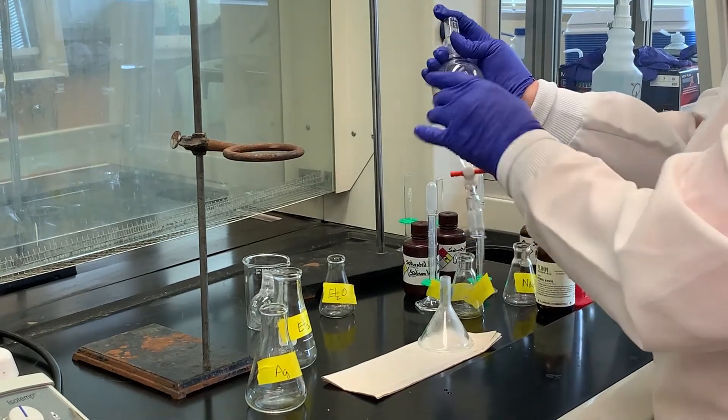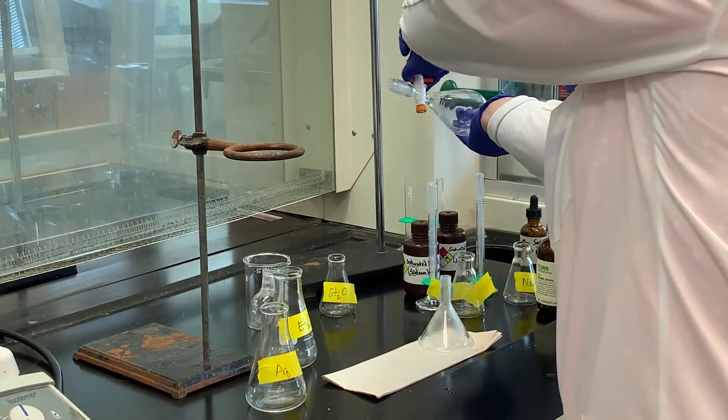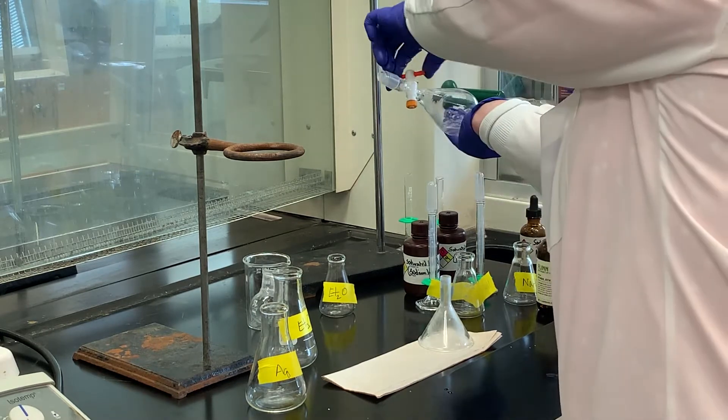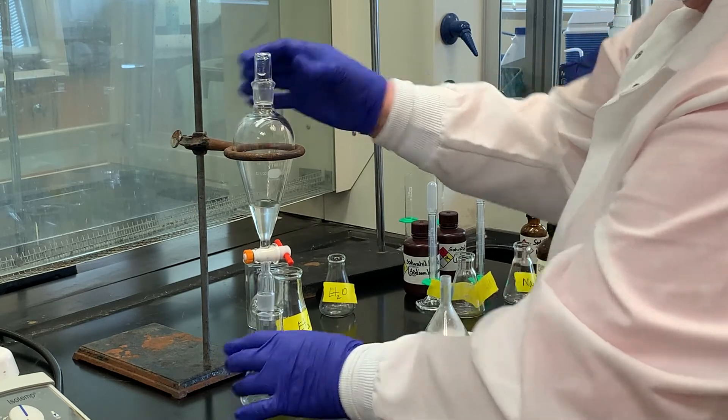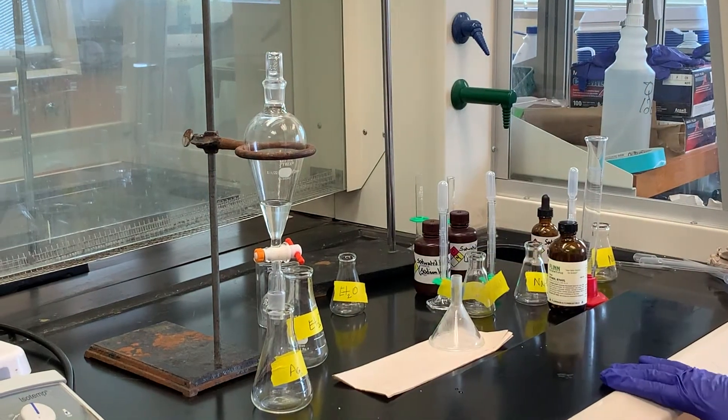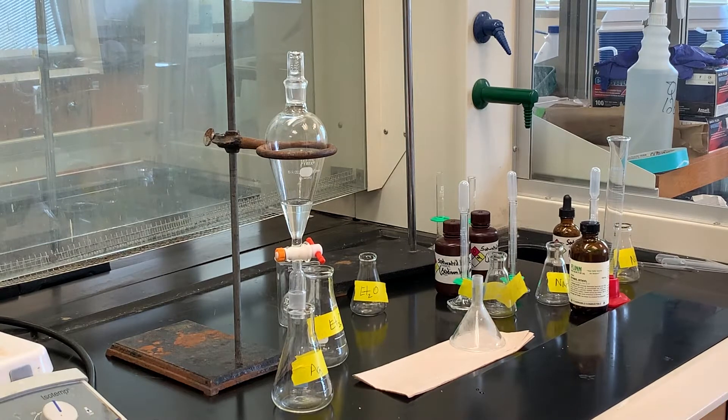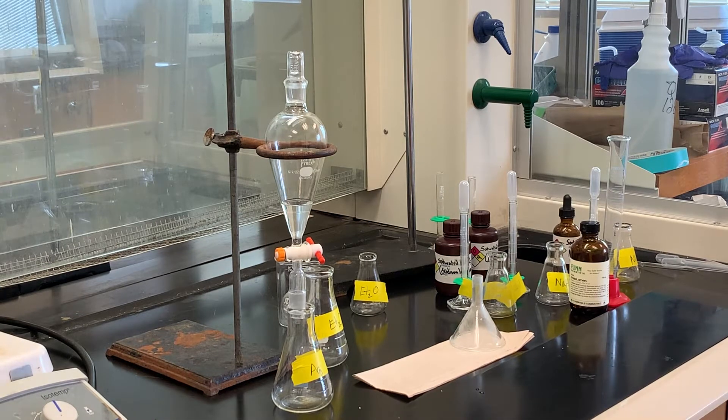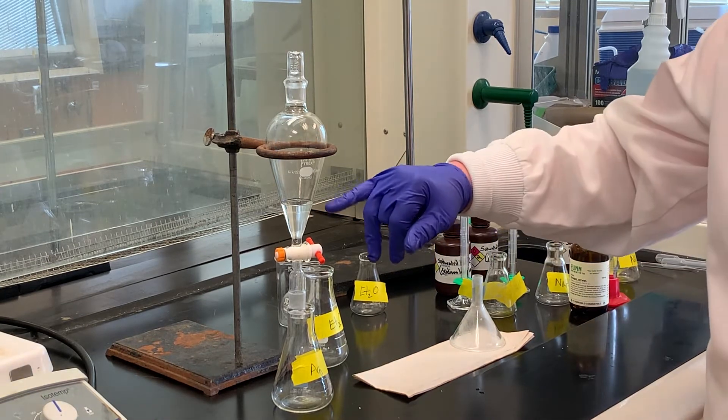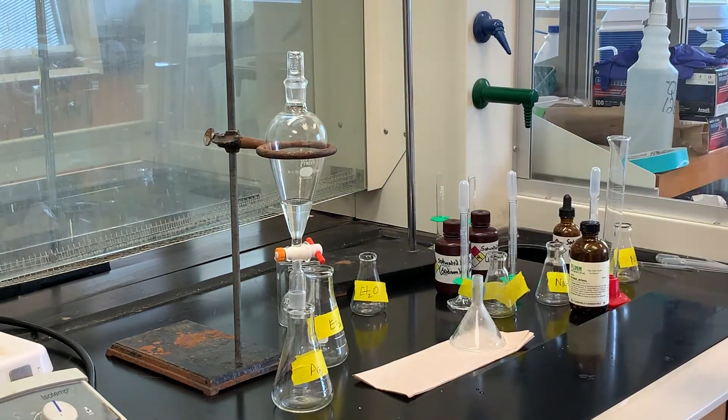So I'm going to shake this and vent it. We'll just let that have time to separate the layers. You could do the test tube test again if you wanted to, just to see which layer is which. The ether does have a lower density than that of the aqueous and the bleach would have been in the aqueous layer.